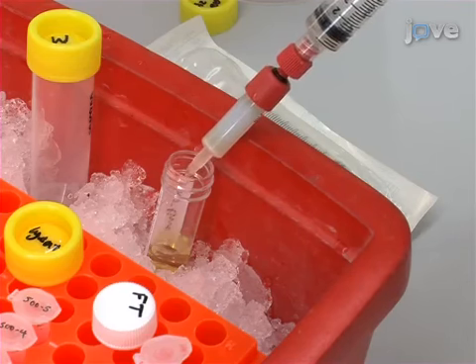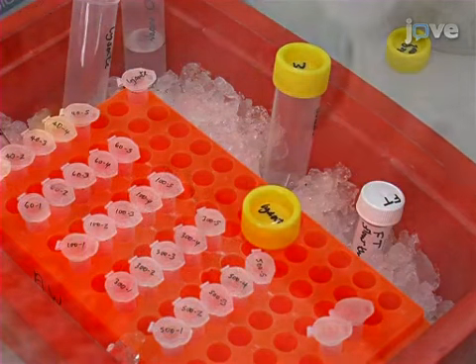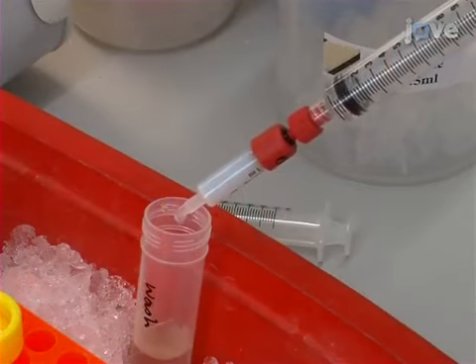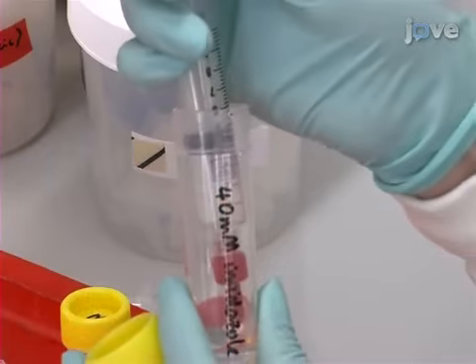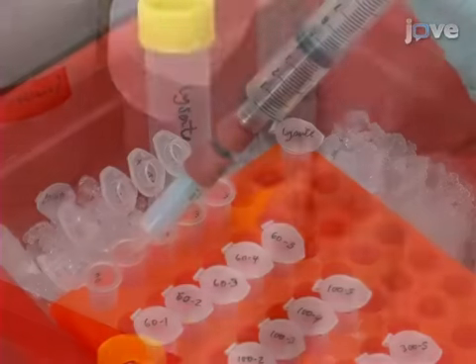Collect the flow-through in a Sterlin Bijou bottle of 7-milliliter capacity, and store on ice. Then wash the column with 10 milliliters of 20-millimolar imidazole. Now pass 5 milliliters of 40-millimolar imidazole through the column. Watch the plunger of the syringe carefully to measure the 1-milliliter fraction.